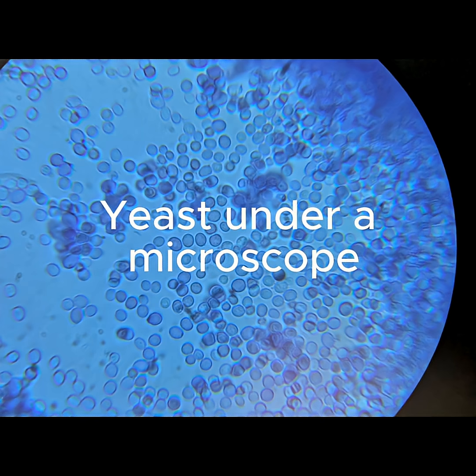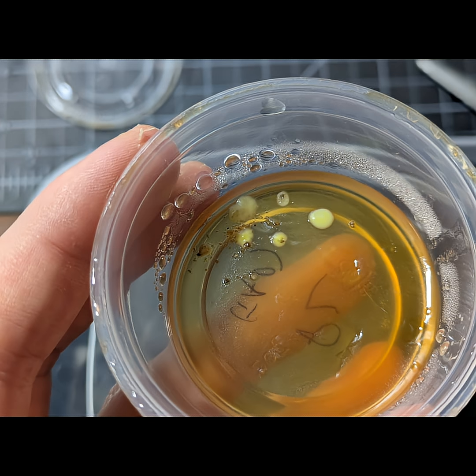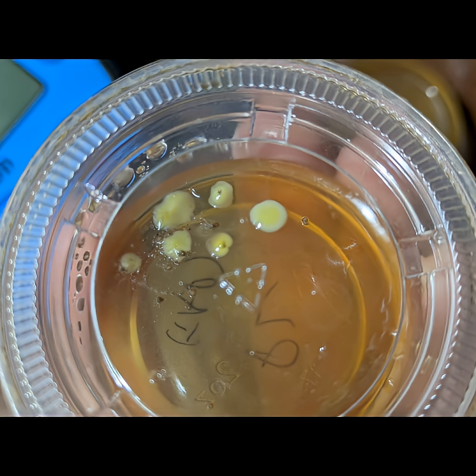I also found this yellow mystery goo growing from the inside of what was supposed to be sterile supplement pills a friend gave me. We're holding back on that one till I know what it is.